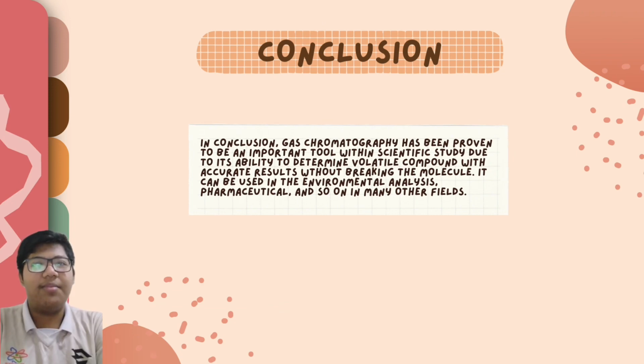Gas chromatography has been proven to be an important tool within scientific study due to its ability to determine volatile compounds with accurate results without breaking the molecules. It can be used in environmental analysis, pharmaceutical, and in many other fields. Therefore, this concludes our video for now.